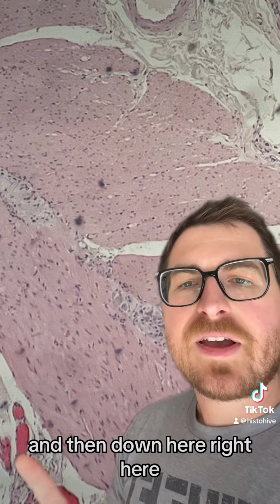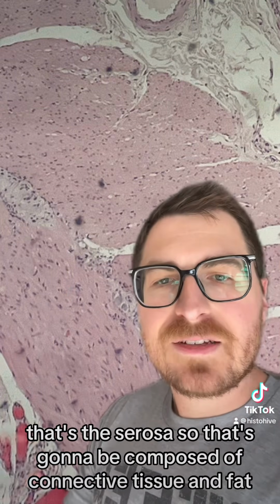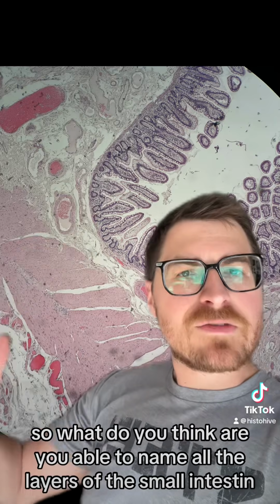And then down here, right here, that's the serosa. So that's going to be composed of connective tissue and fat. It's essentially just looking to anchor the organ in the abdominal cavity. So what do you think? Are you able to name all of the layers of the small intestine now?